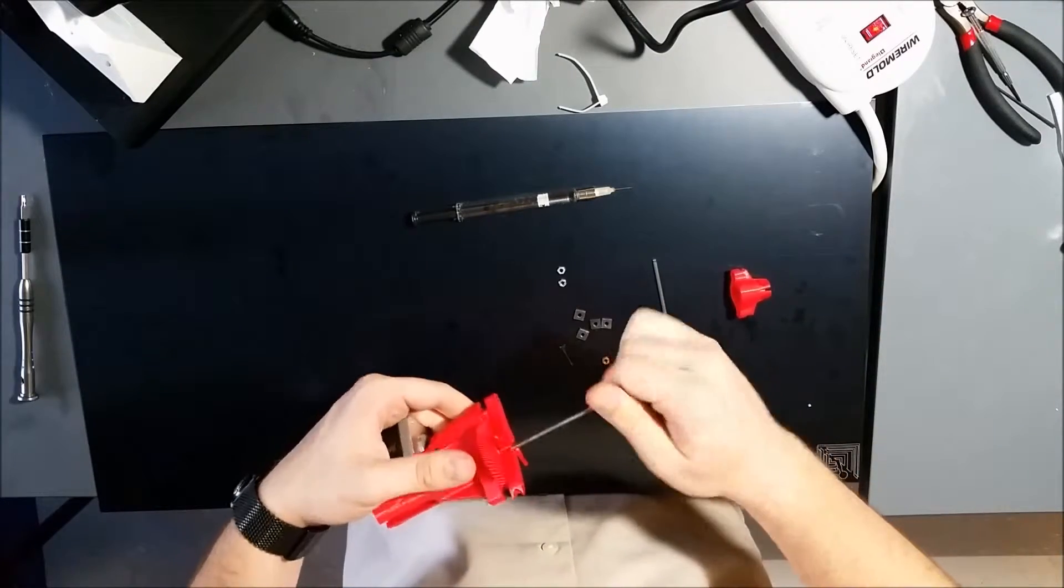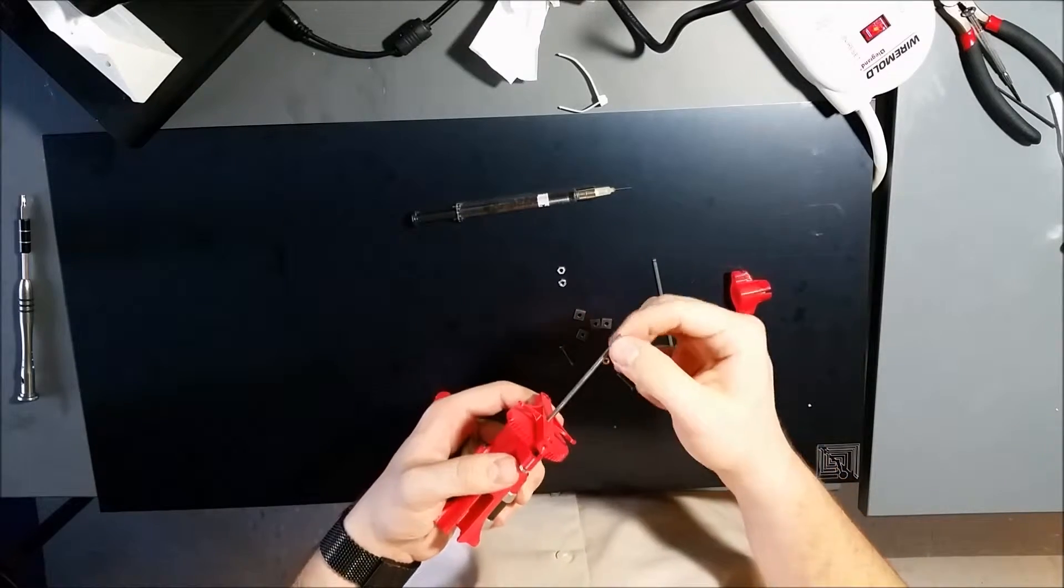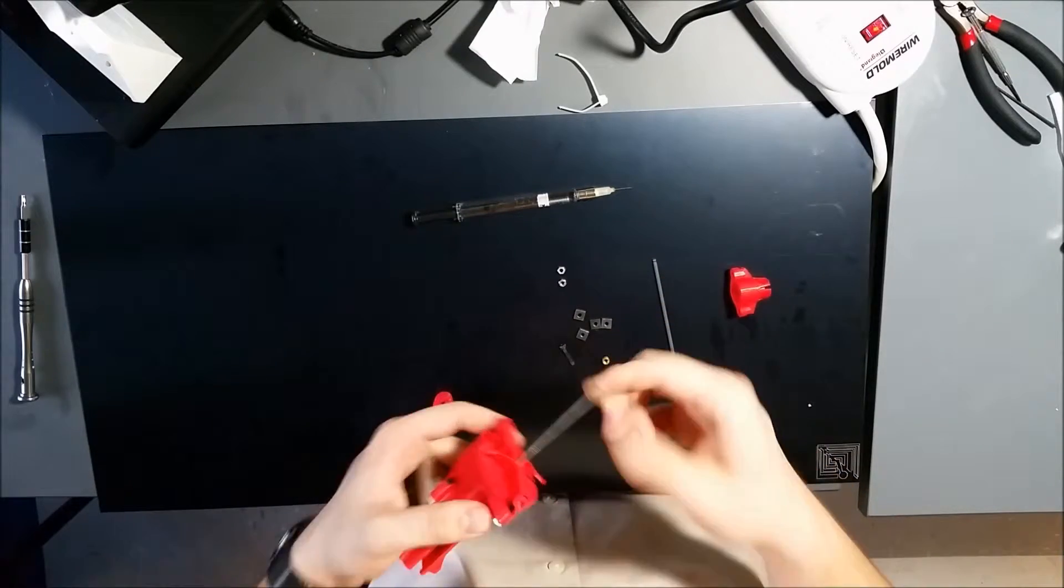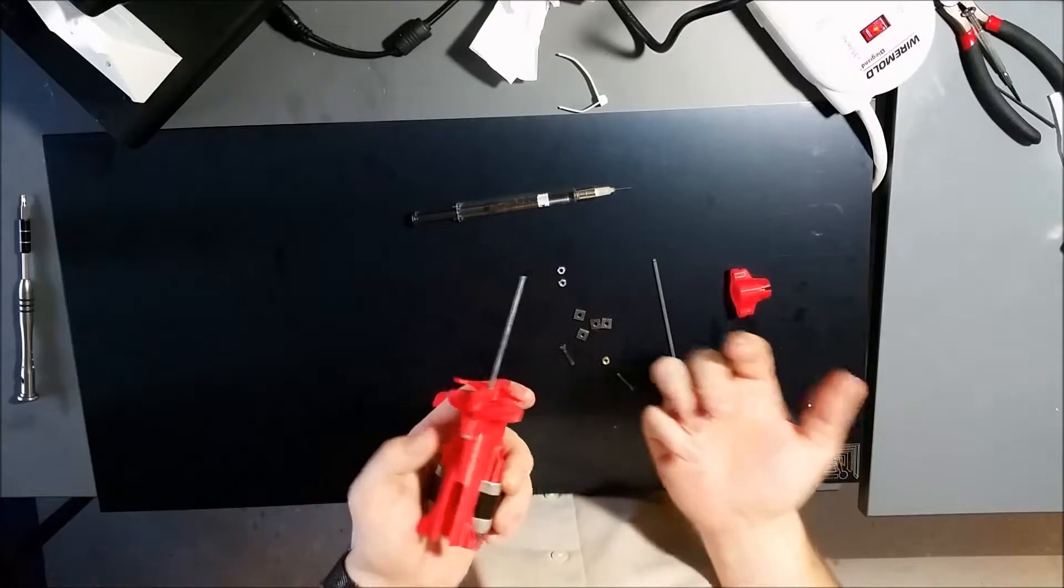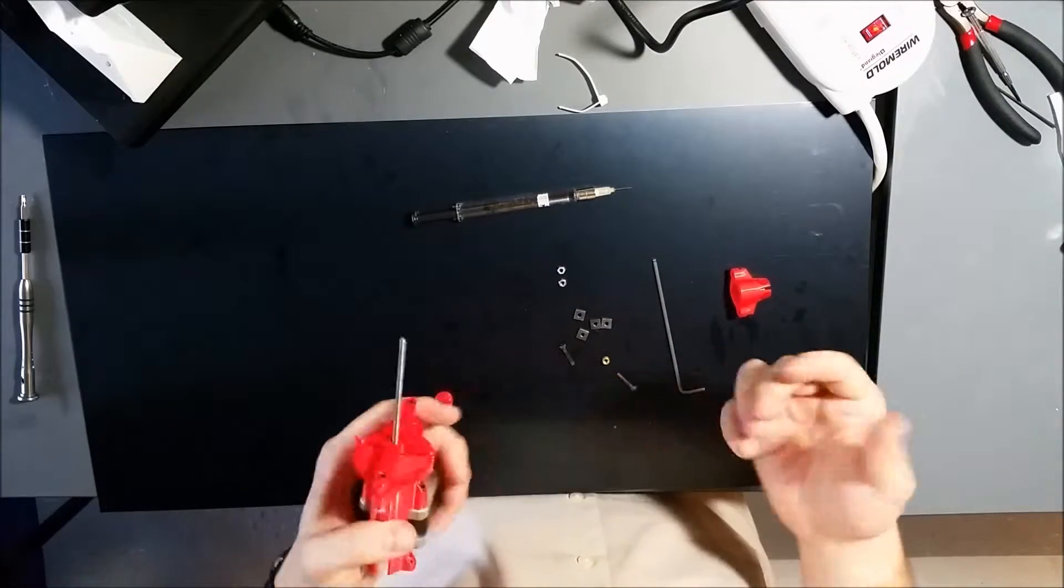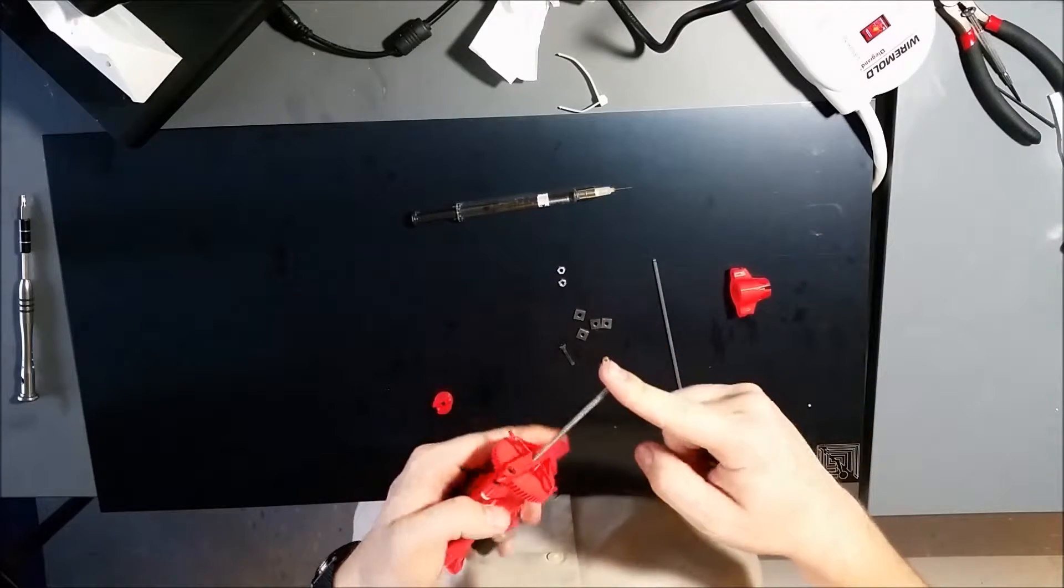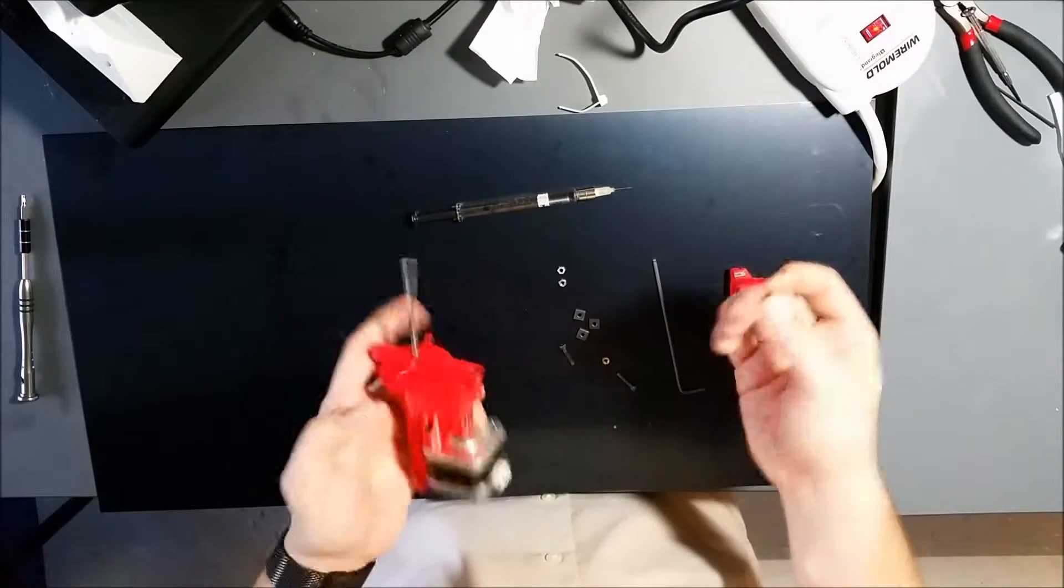So now the lead screw's in and it should be able to spin freely. But the problem is there's still going to be a little bit of play in the lead screw. And the way we chose to eliminate that was just to take a standard office rubber band and basically push the lead screw down.